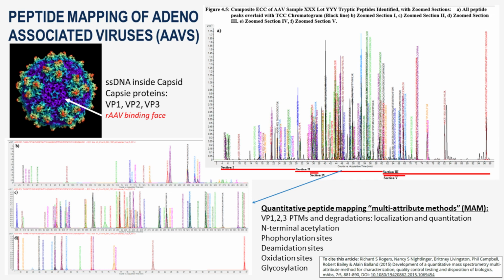For the purposes of this talk, one of the ways of using this information now then is to track these deamidation sites, oxidation sites, because if those sites are present in this AAV binding face, it's good to know about these. They may need to be engineered out. For example, if there's too many NG sites, something like that, on the binding face, it'll change the charge dynamics. Deamidation will introduce a negative charge.